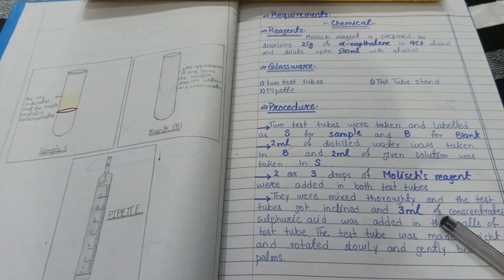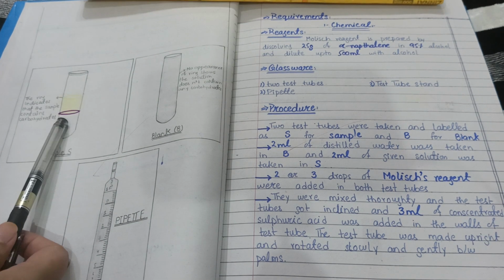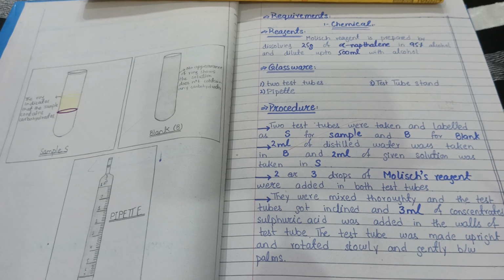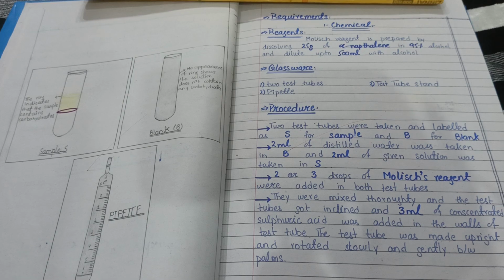One thing you have to keep in mind: don't rotate it very vigorously, because as you see in the results, only a ring is going to appear, and whenever you rotate it very fast there is a chance that this ring will be distorted, so you should be careful about it. Now we move on to the next page.